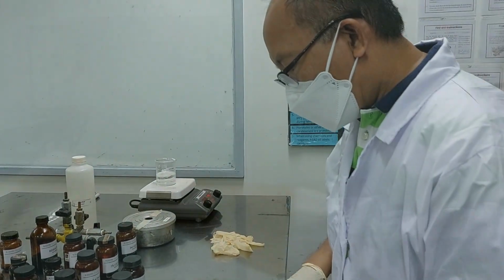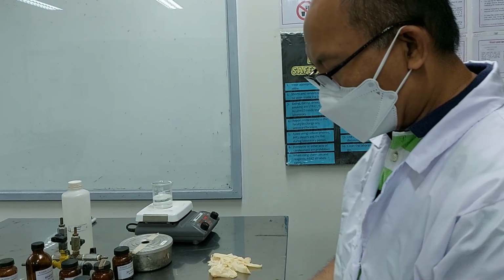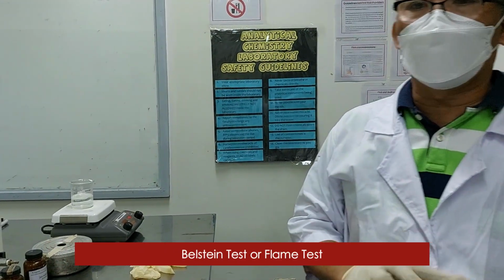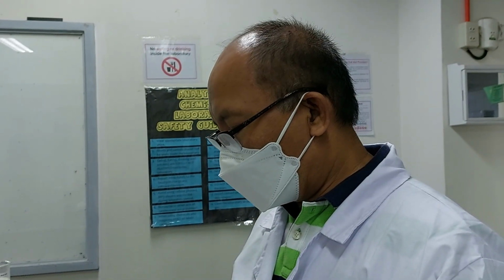Okay. Let's compare, that is for test for halogens. So now let's go to Beilstein test or flame test. So I think we have done this in your inorganic chemistry. So let's see. We can also test the presence of halogen by heating halogen containing compounds like alkyl halide.